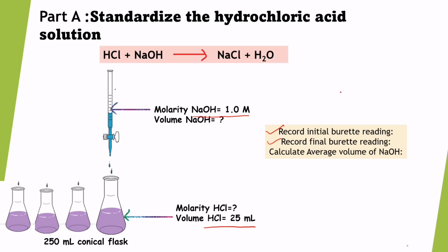So now we can calculate the molarity of HCl, because we can get the volume of NaOH and we also have the molarity of the NaOH solution.